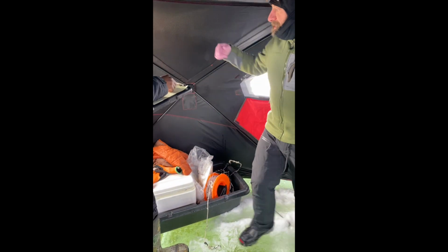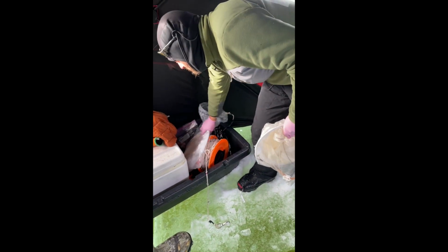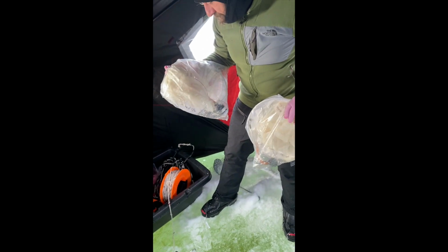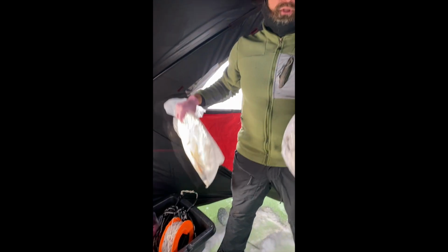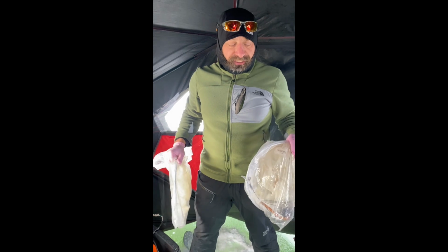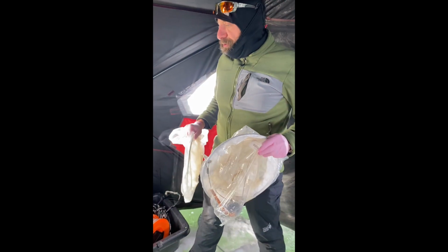So our next step is to do zooplankton net tows. We have 2 nets, both 30 centimeters in diameter, an 80 micron mesh net and a 35 micron mesh net. We're going to collect duplicate tows with each of these nets, starting with the 80 micron and then switching over to the 35 micron net.